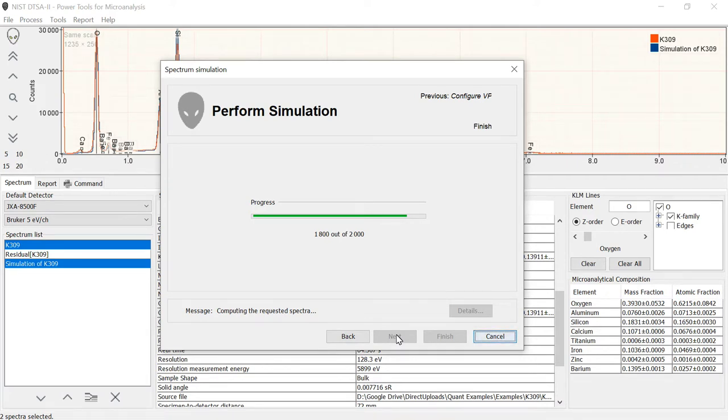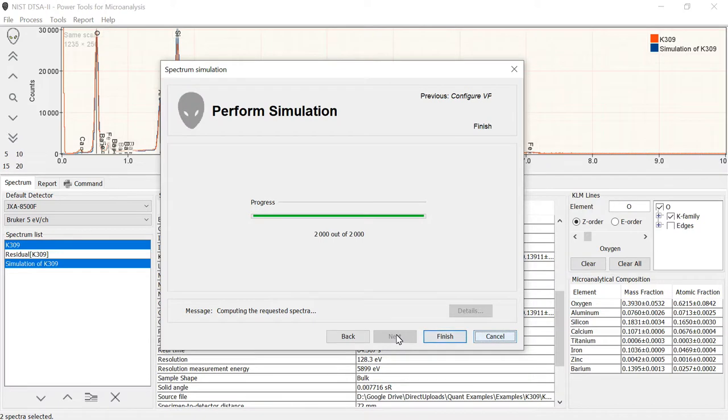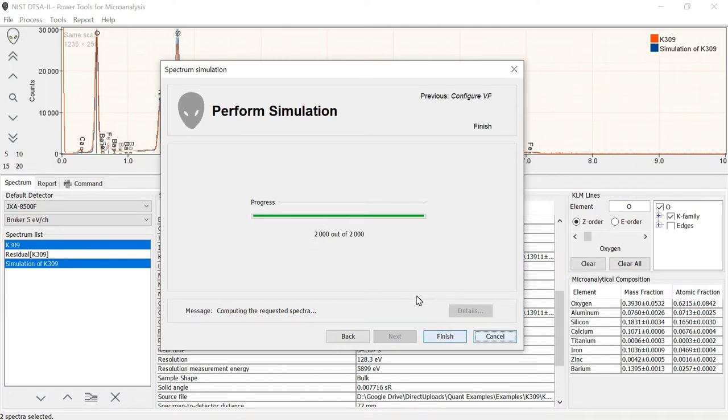Certainly, you can model a spectrum in less time than it takes to put the sample into an instrument and collect the equivalent. So it's often far more efficient to do the modeling rather than to go down to the instrument. Plus, you get a lot of additional information out that you wouldn't. So the model's done. We ran 2,000 electron trajectories and we click Finish.